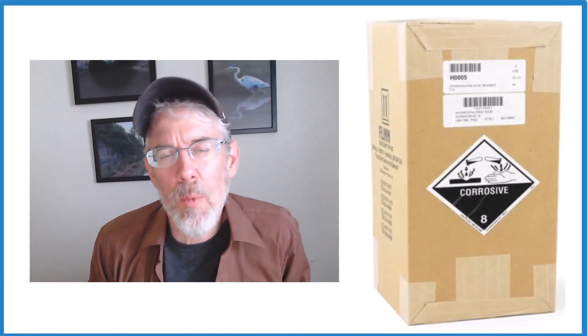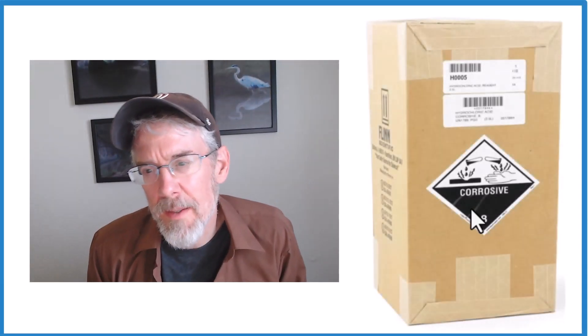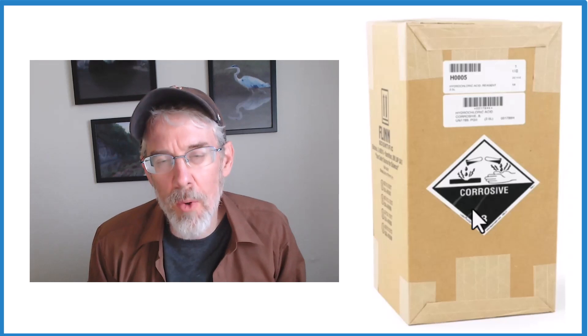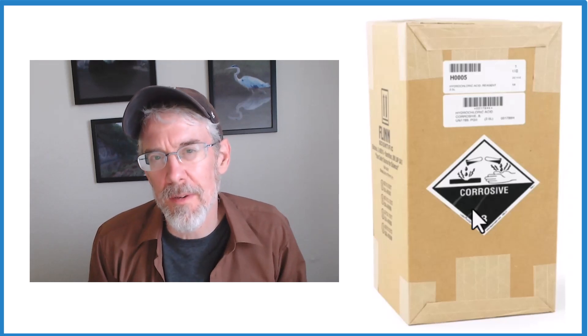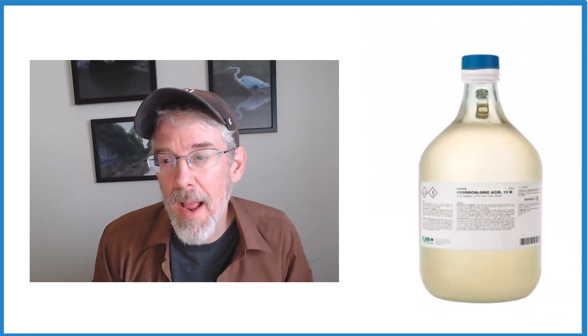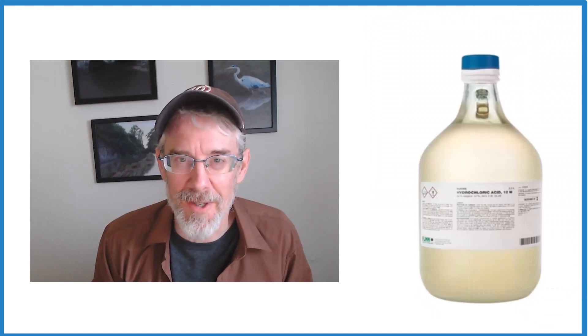This is Dr. B, and we're going to take a look at three ways to make a one molar solution of hydrochloric acid. So let's open the hydrochloric acid up and get started.